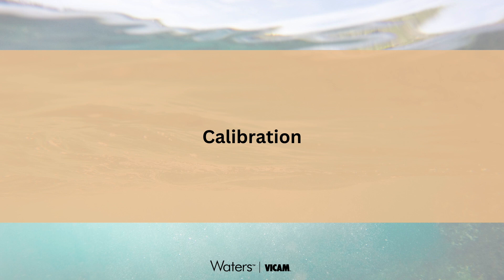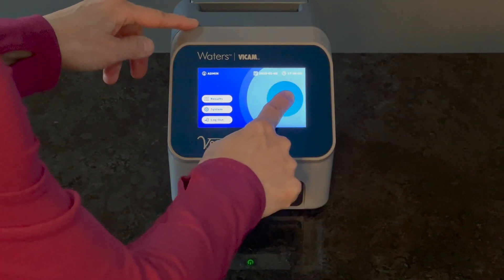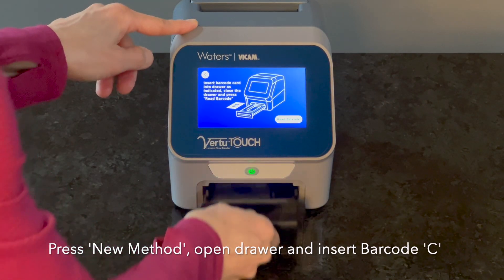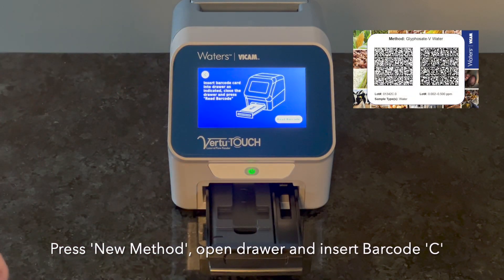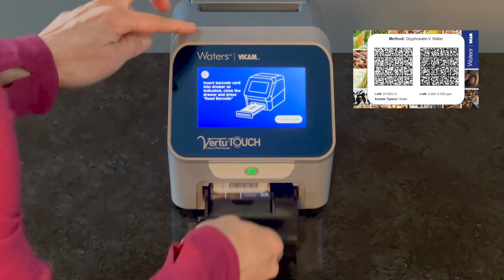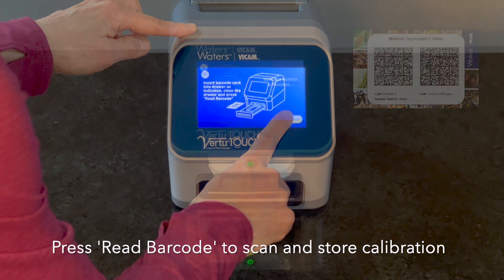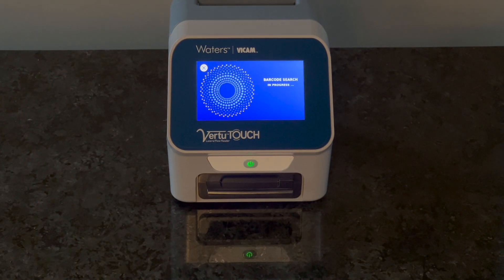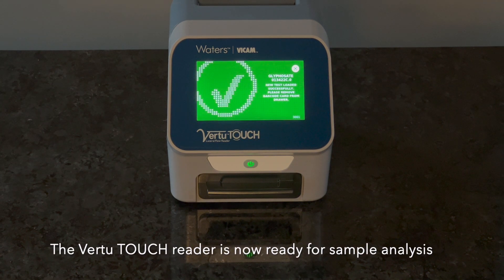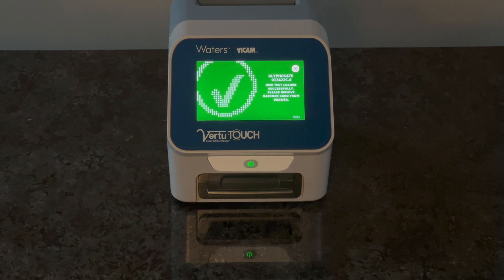Start by calibrating the Virtu Touch Reader using the barcode supplied with the Glyphosate V kit. The Glyphosate V Water Method will enter barcode C. Once the calibration barcode is scanned, the Virtu Touch Reader is ready for sample analysis.